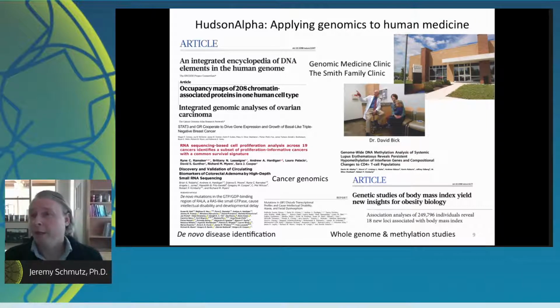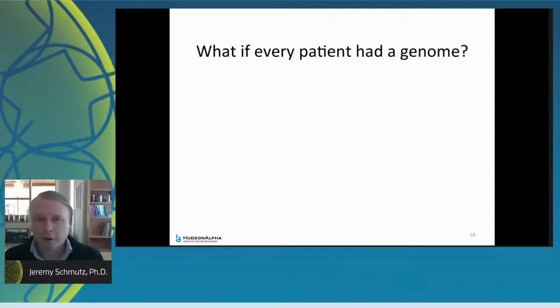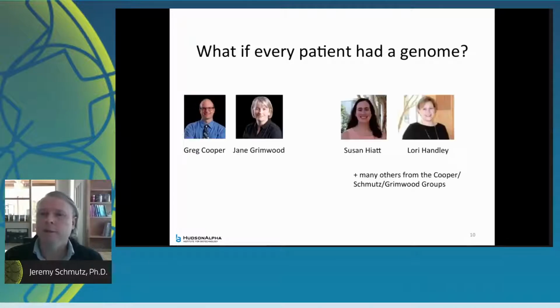So we've worked on plants, I just said, and other things for a long time. And so one day we were sitting around as faculty thinking, what could we really do to bring this new technology that we were working on in plants to humans? And so this was the question: what if every patient had a genome? No longer were we talking about panels and targeted assays and exome capture and whole genome shotgun. What if we just produce genomes for people?